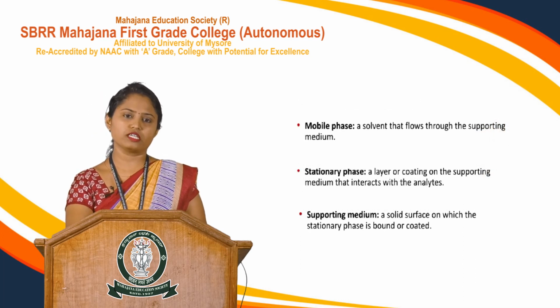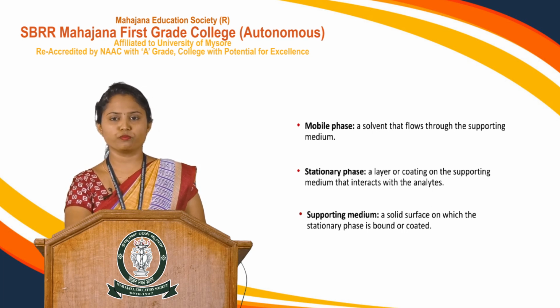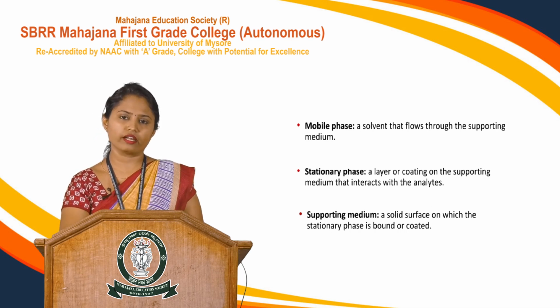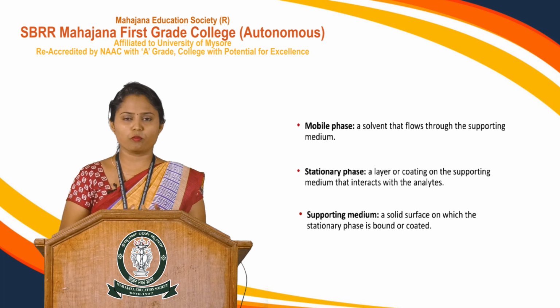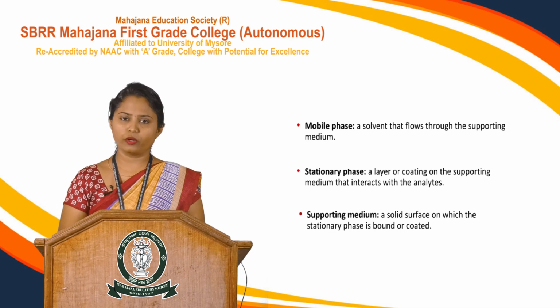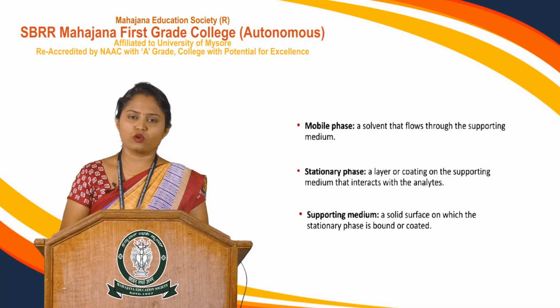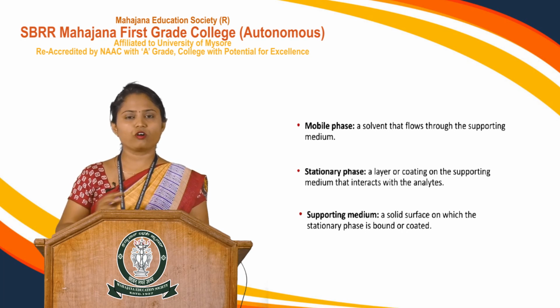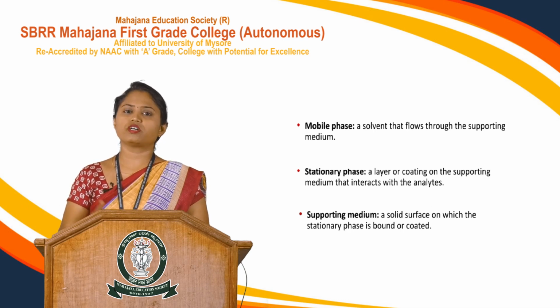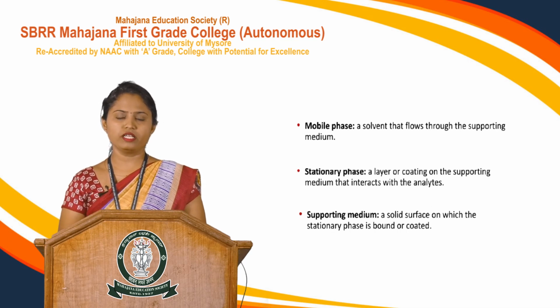The other terminology is the mobile phase. Mobile means it acts as a carrier. It carries the sample or analyte whenever you subject a molecule or a complex mixture to a chromatographic run. This mobile phase can be either a liquid or a gas. The role of the mobile phase is to carry or sweep the sample over the stationary phase, where the analytes, depending on whether they prefer the mobile phase or the stationary phase, get partitioned between the two immiscible phases.